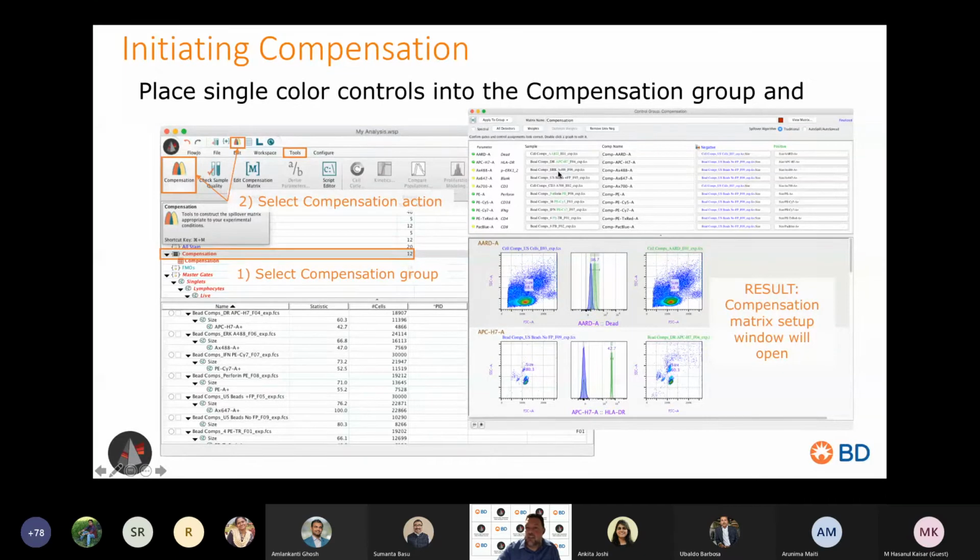If there's not the perfect spelling, your parameter is a little bit different. This says AX488 versus A488 is the parameter name that was typed here. It'll give you a yellow warning saying, oh, I don't see the name, but that's fine. You can still move forward.